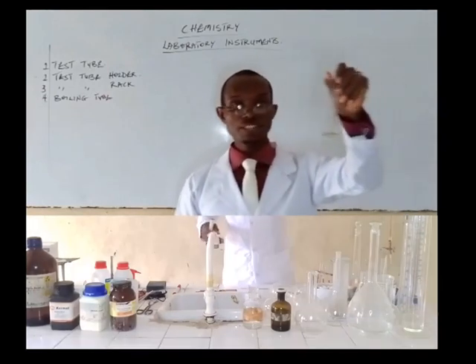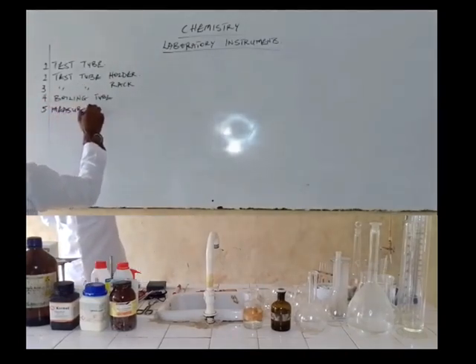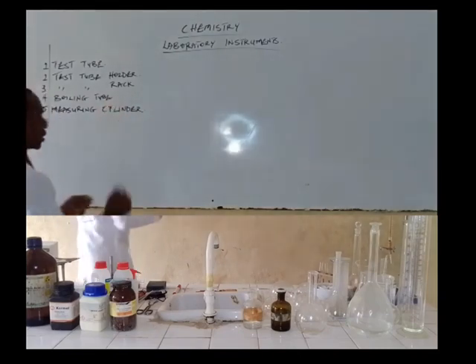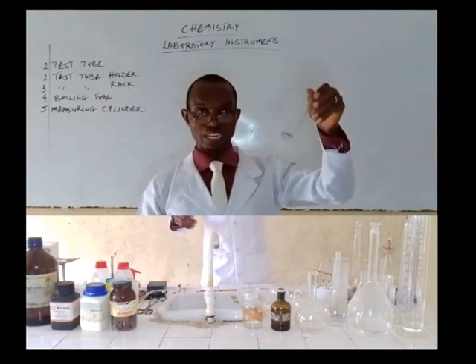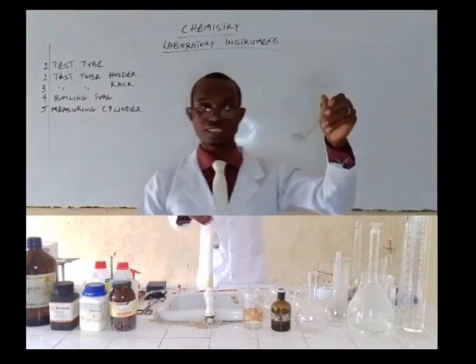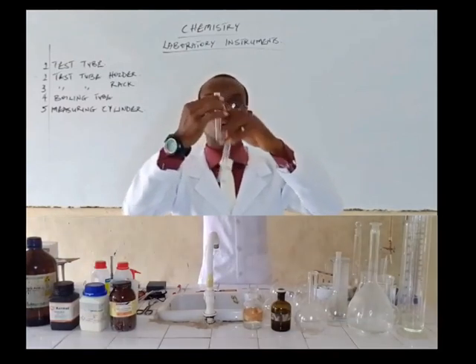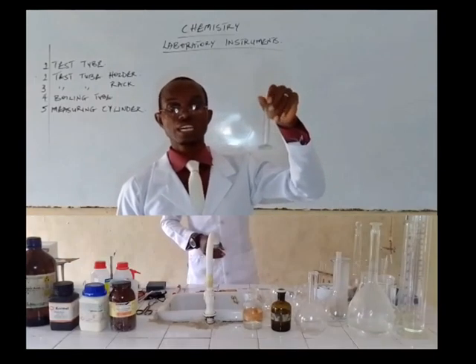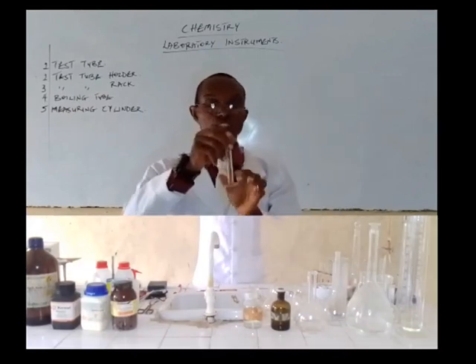Next, we have what is called a measuring cylinder. We use measuring cylinders to measure chemicals, particularly when we want to dilute our chemicals and need to measure accurately. We use measuring cylinders because they are graded — our test tubes are not graded, we do not have measurements on them. But measuring cylinders have graduated measurements and are accurately used in the measurement of reagents. They are of different sizes; this one, for example, is a 10 ml measuring cylinder.